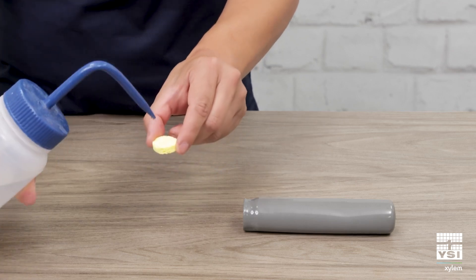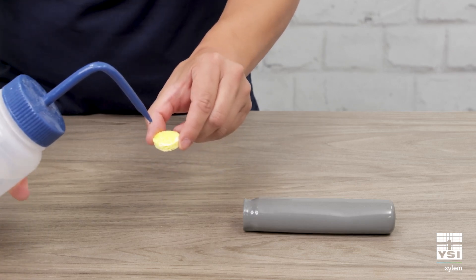In this video, we'll cover the one-touch calibration feature for the Pro 20 dissolved oxygen meter. Saturate the sponge with a small amount of tap water and put it into the storage sleeve.